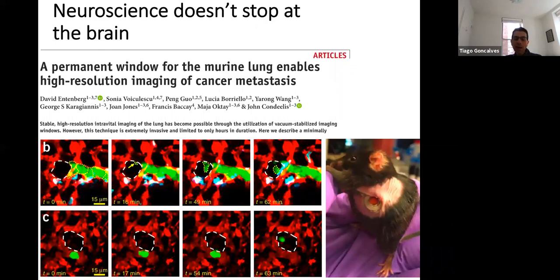Yes, there is a paper by Naji using a Bessel beam to do z scanning with these microscopes. But I think that's highly experimental. That's all I know about it.